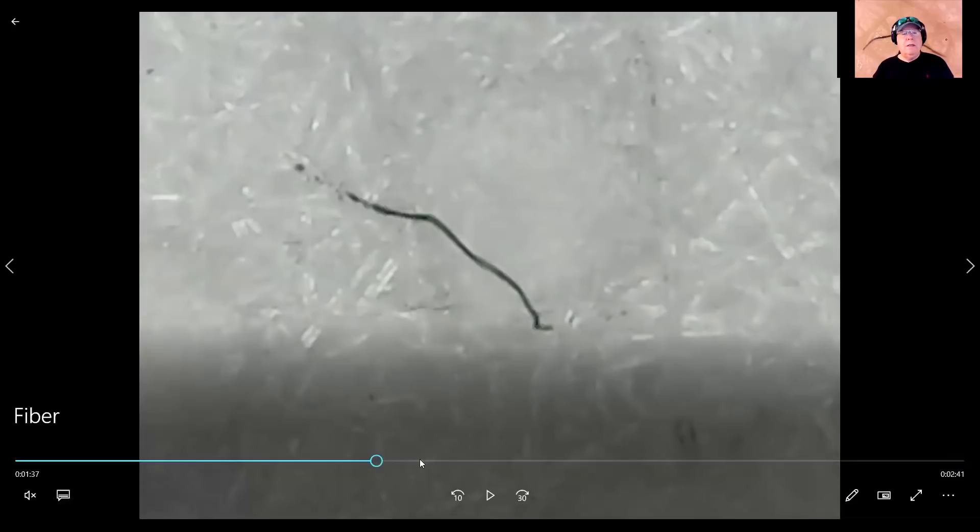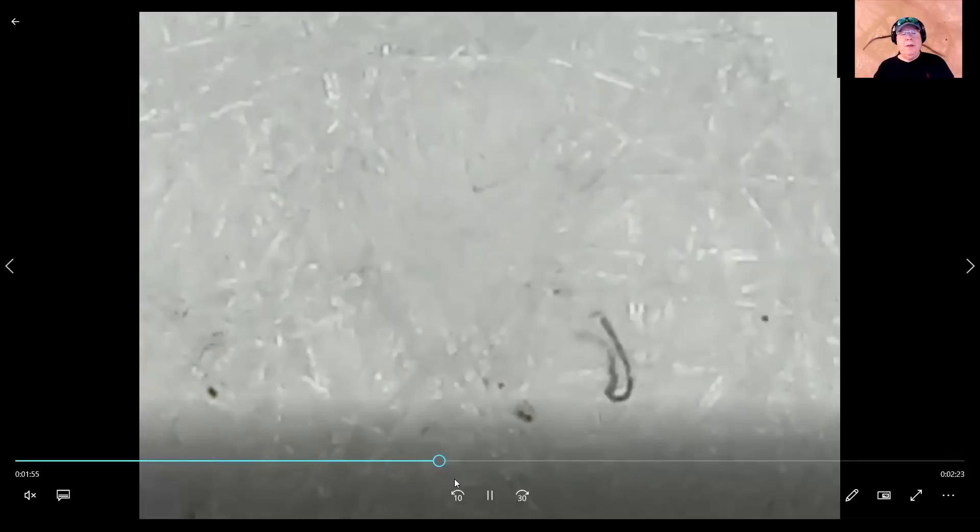And I have a little booster on this where I can actually, when I capture something that I want to really see, I can bring in the application just a little bit more. So there you go. We can go back and take a look at, I don't know what these are again. But I'm going to be doing more experiments on this to find out what is going on here, but there's clearly something going on. I mean, come on folks. That's just, I don't know what that is. Let me get it back into frame. So I don't know what these are. They look awfully familiar though to what's on my background in the blue screen.